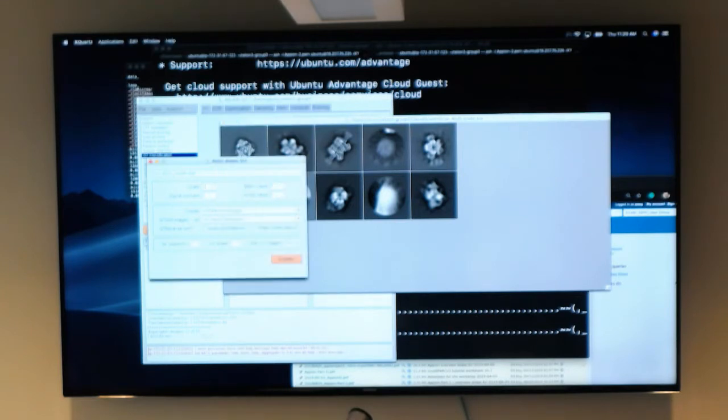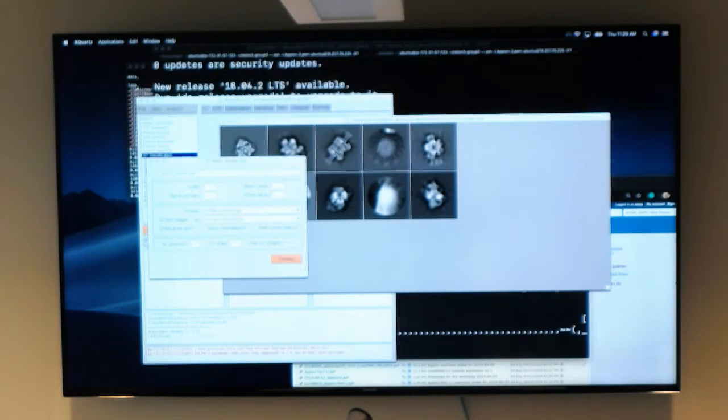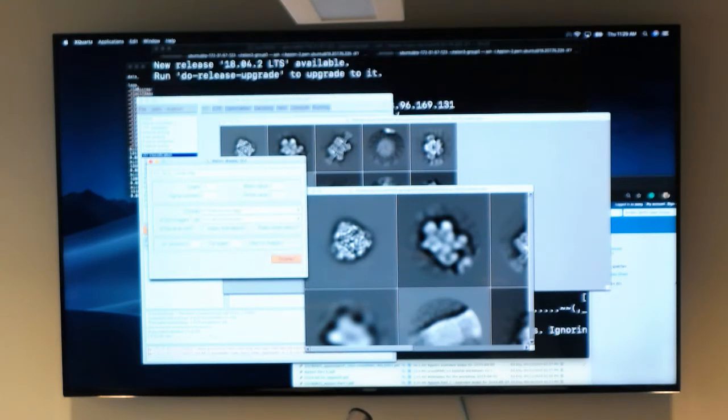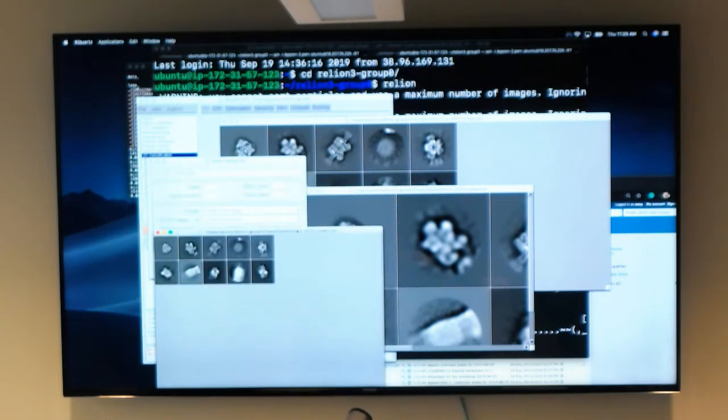It's a little clunky, so let's say you want to scale, let's say you want even larger ones. You can do 2, and it'll be even larger. Or if I want it smaller, I can scale it. Damn, it's so tiny. So the first 5 or 10 iterations, it might not look like that much, but after that, you'll start to see pretty good alignment.